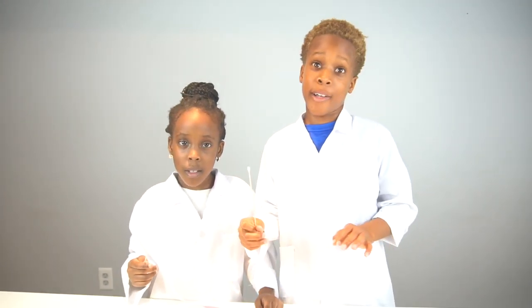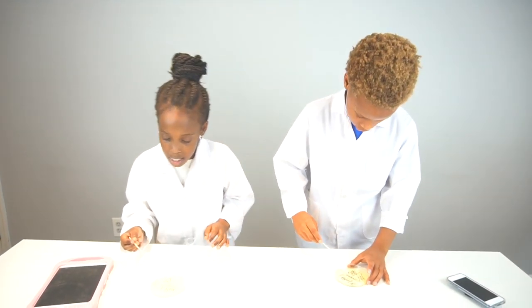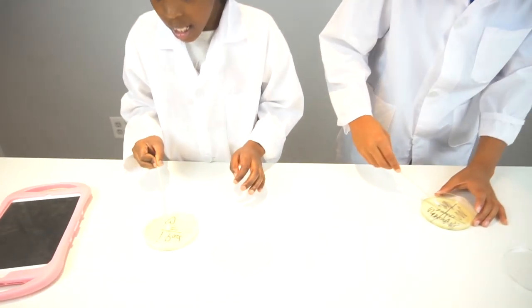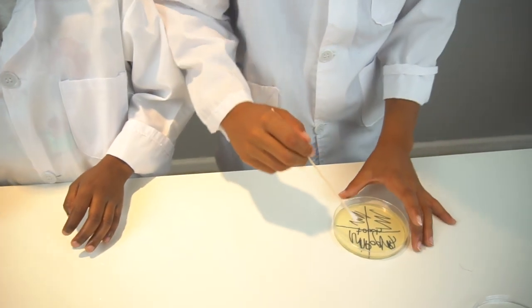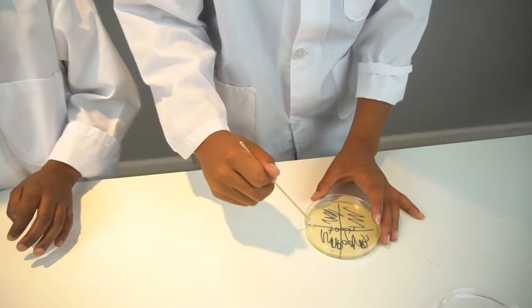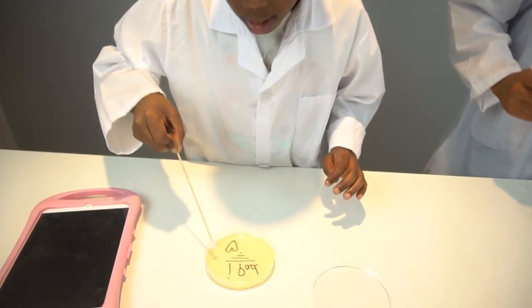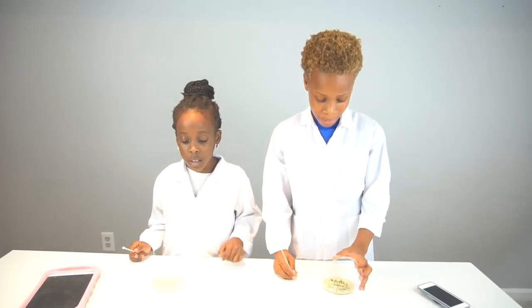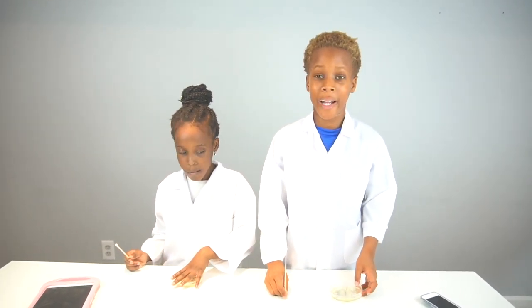You guys might even barf! Now we're going to lightly apply the bacteria to the agar, making sure to cover every section — one section, two sections, three sections, four sections. Now we're going to cover it and save it for a week, then come back to see how much it grows.